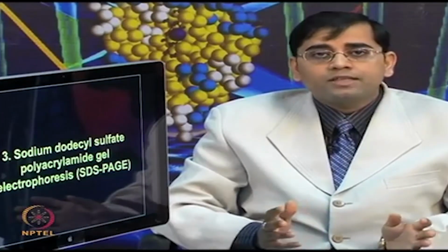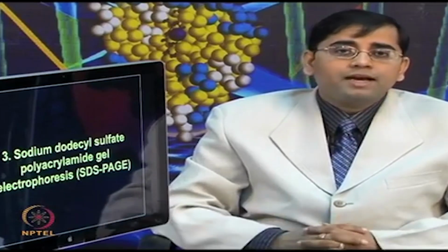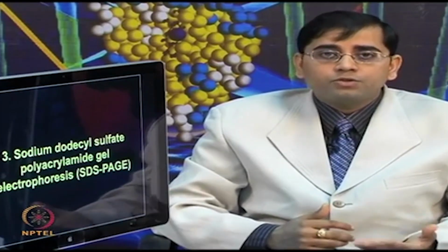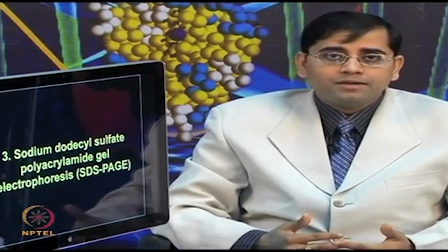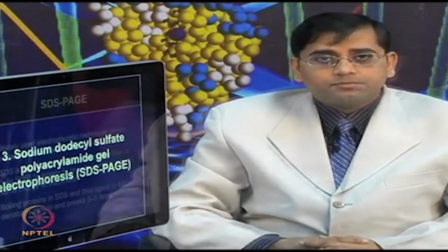You have already focused the protein in the gel in the first dimension based on the IEF. Now, the second dimension separation, you have already prepared the strip to be loaded on the SDS page gel. So, rest of the step can be uniform or similar to what one can expect in regular SDS page.